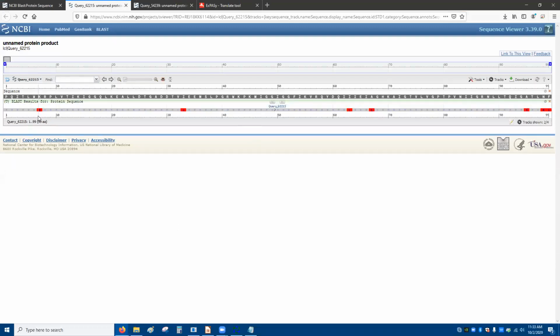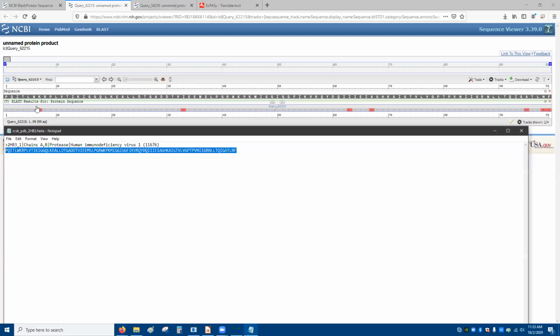See, now there is a letter in here indicating which base is different. And then we're just going to double check to see which one is on top. Look here, we're after TLW, so TLWK. So the top one is what we want. This is what it is currently.